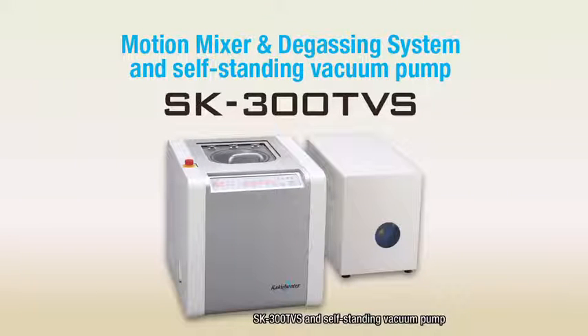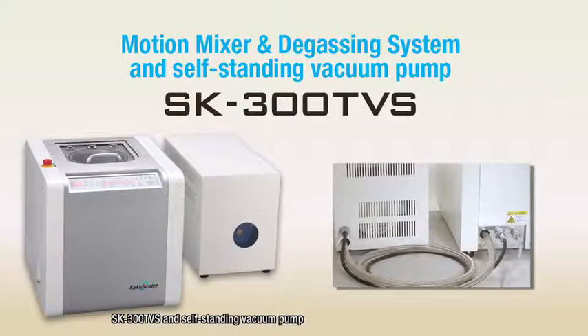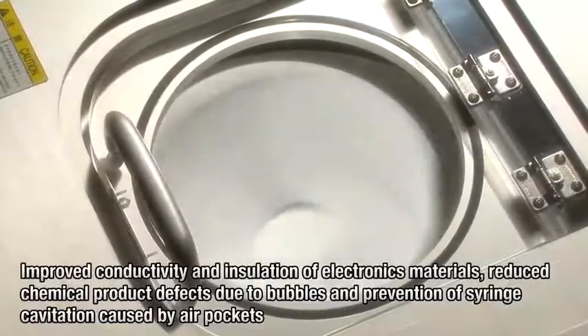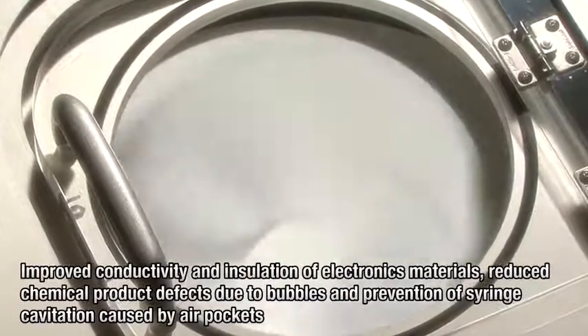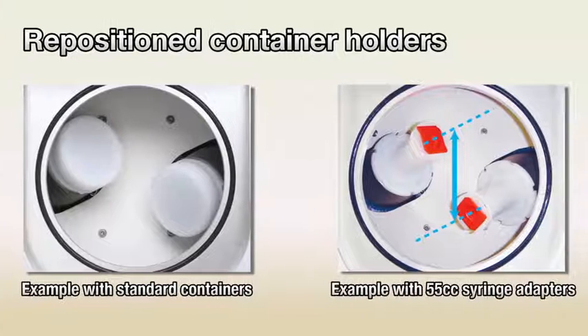We will explain the depressurizing feature of the SK300TVS with vacuum pump. The SK300TVS adds depressurization to mixing and degassing by revolution and rotation to remove microscopic bubbles. This feature can be used to improve conductivity and insulation of electronics materials, reduce chemical product defects caused by bubbles, and prevent syringe cavitation caused by air pockets. Furthermore, mixing performance has been enhanced over earlier models by repositioning the container holders along the rotating axes so that the material contacts a larger surface area of the container.